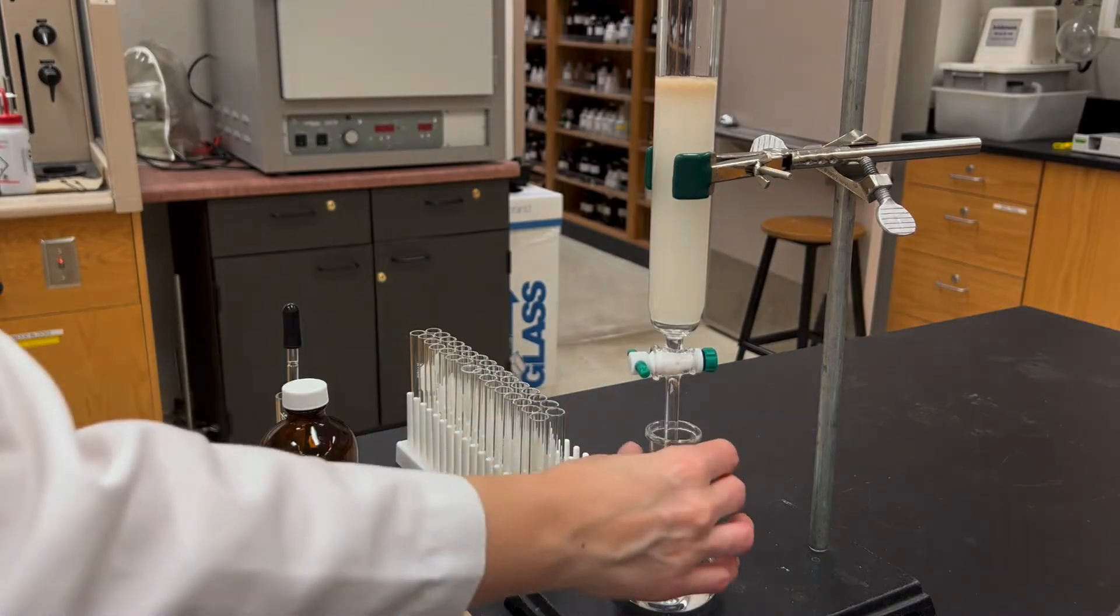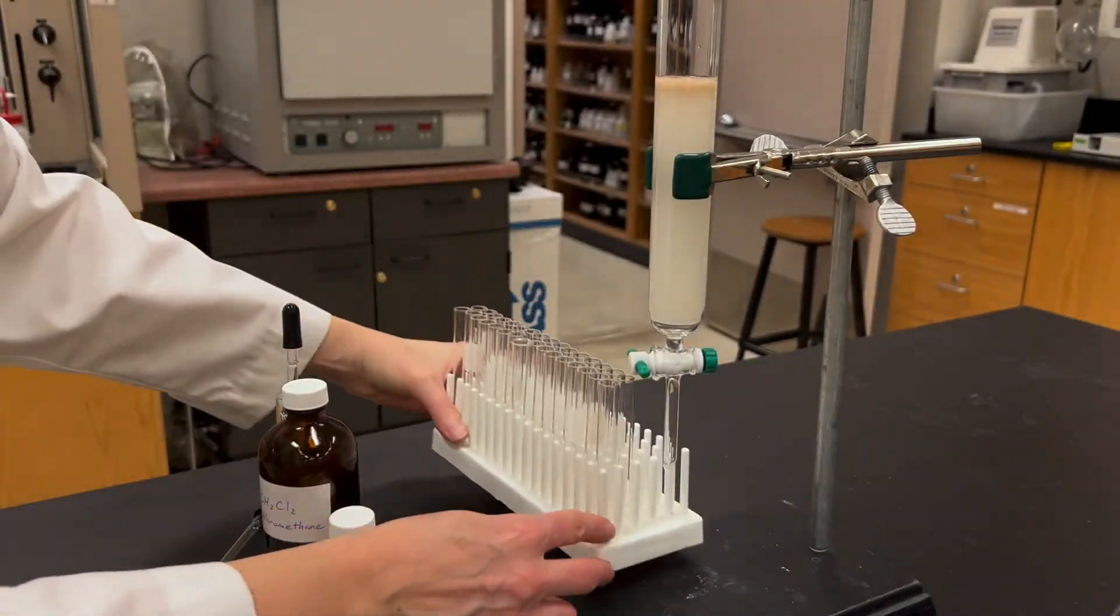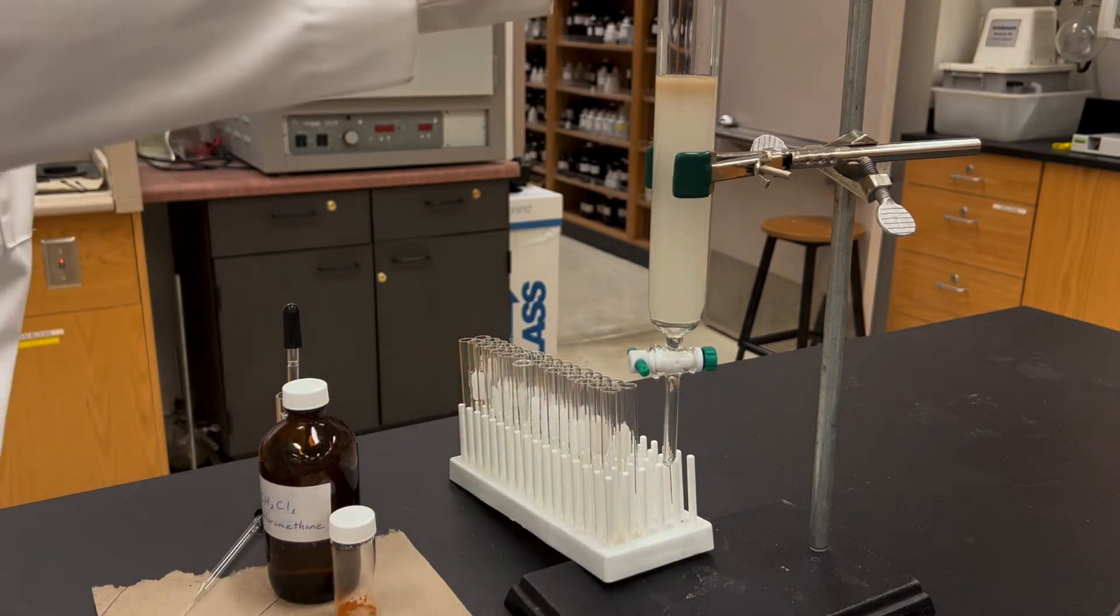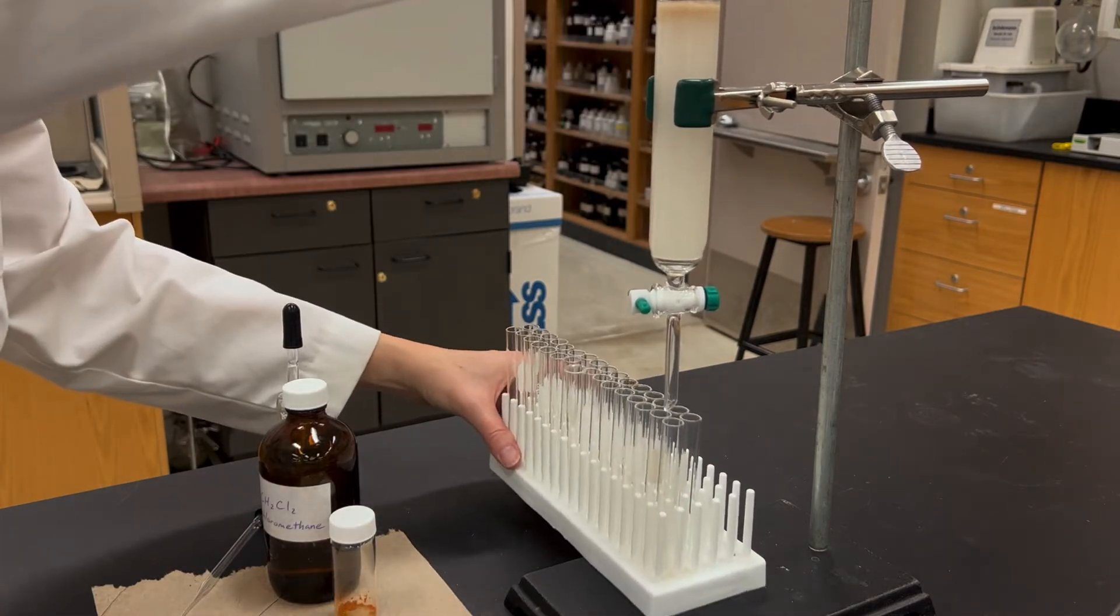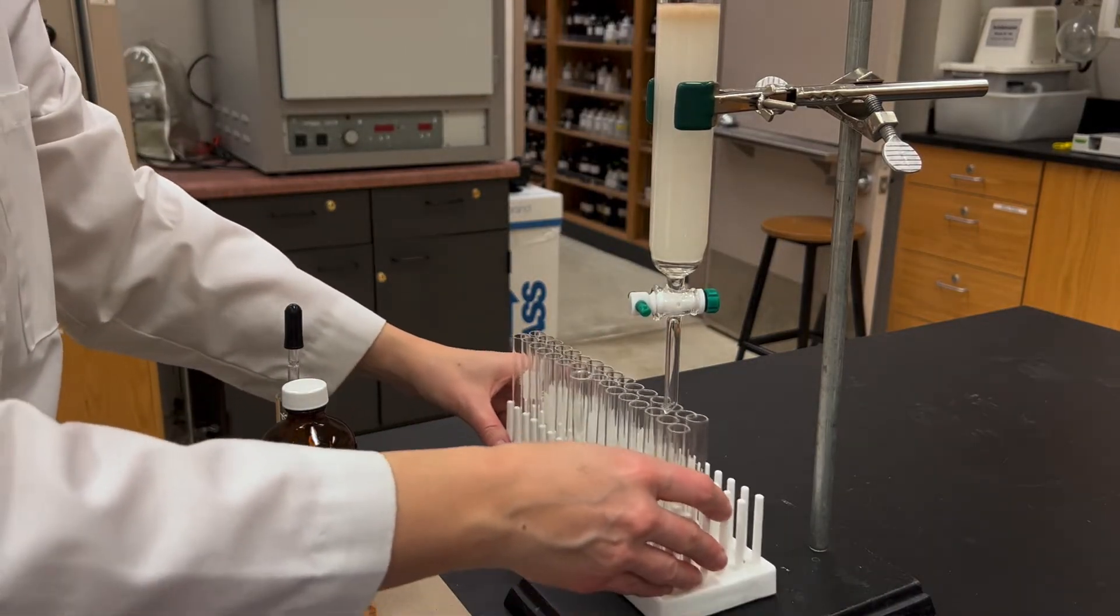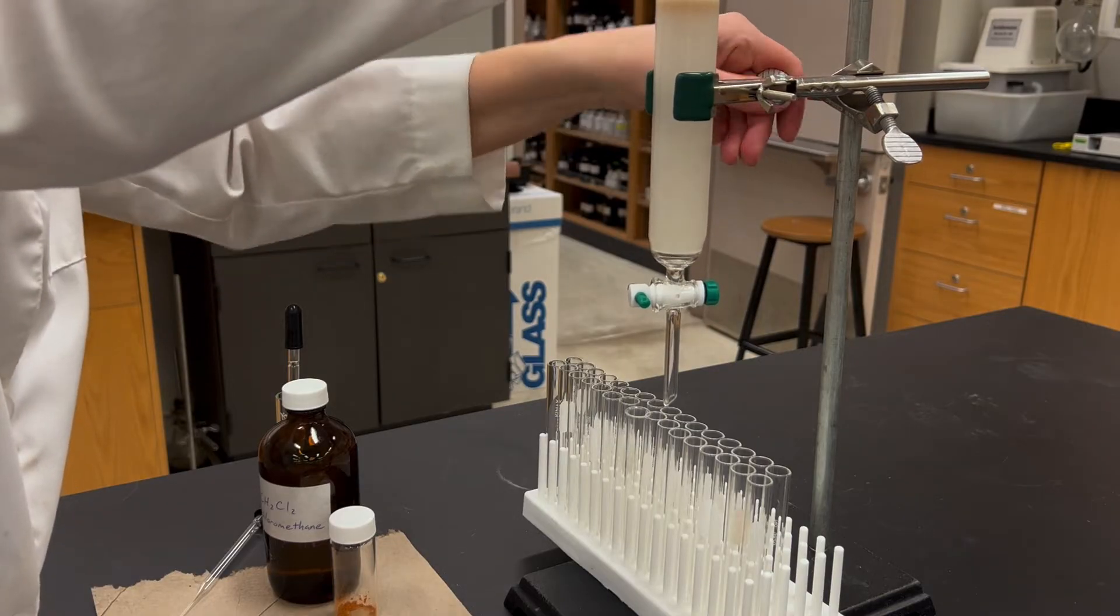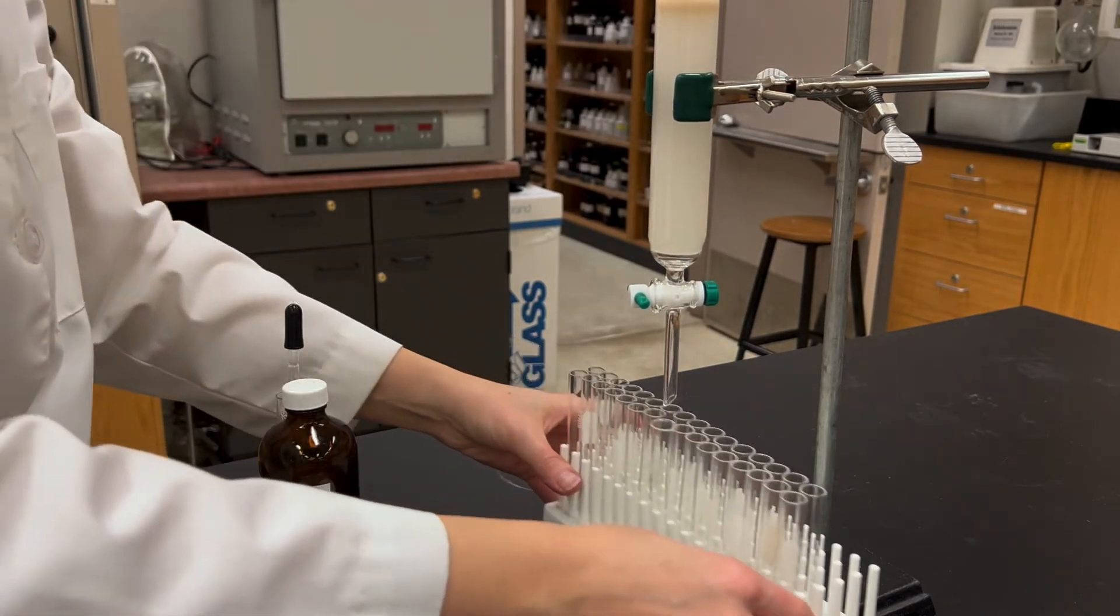I'm going to collect fractions from the column so I want to prepare for that next. Fill a test tube rack up with some test tubes and then position that underneath the column and make sure there's space. You may need to raise the column up, but then put the test tube rack and move it left to right and make sure that it's not going to bump the tip of the column at any point.